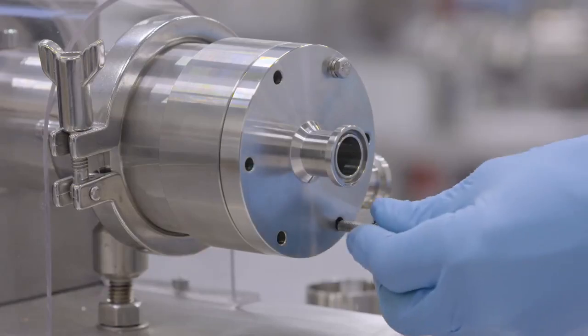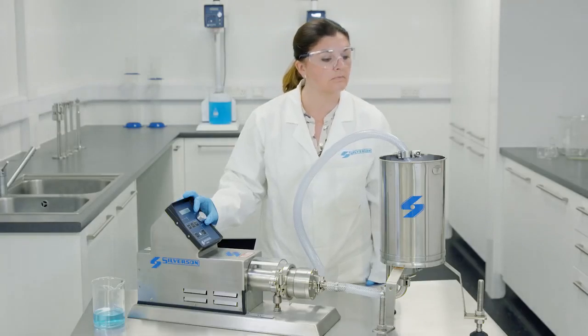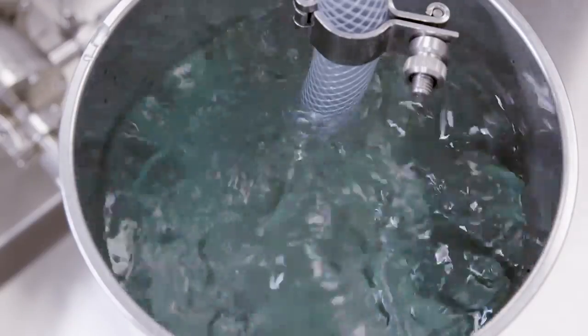It will create stable emulsions and suspensions, reduce particle size, rapidly dissolve solids and eliminate agglomerates and fisheyes.